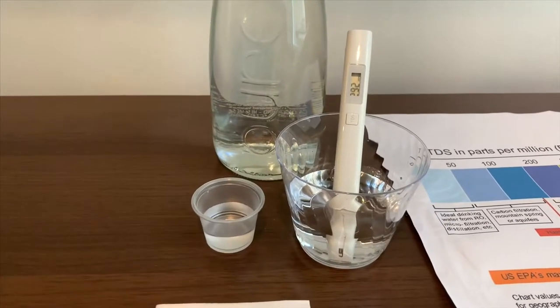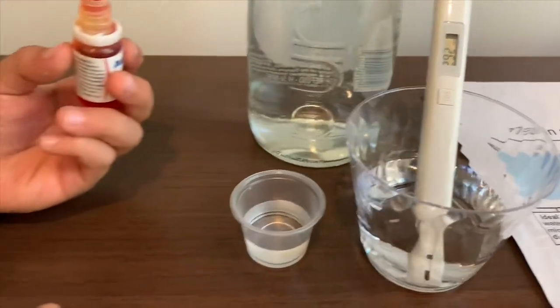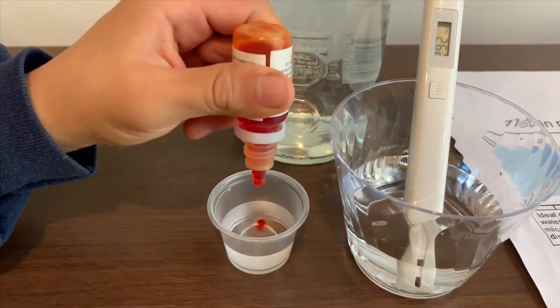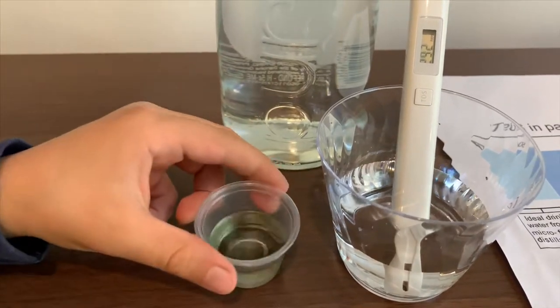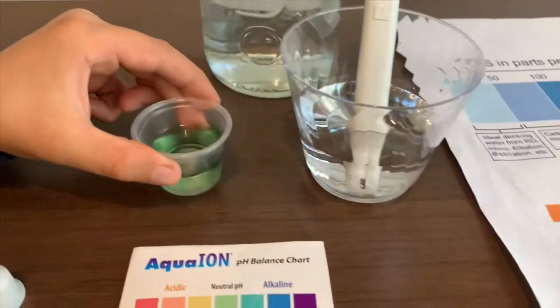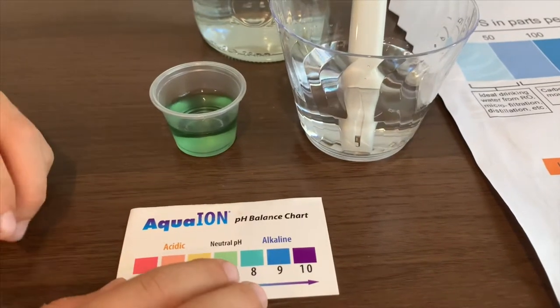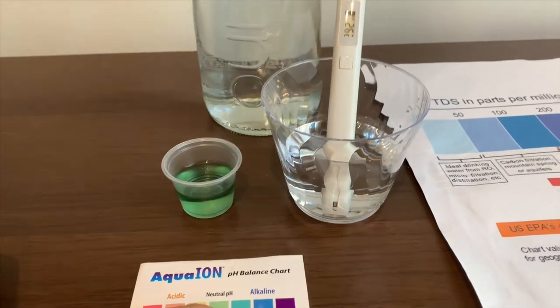Now let's test the pH level. Open the cap carefully and only do two drops. I say this is a 7.5 — that means it is also the same as Evium Kids.